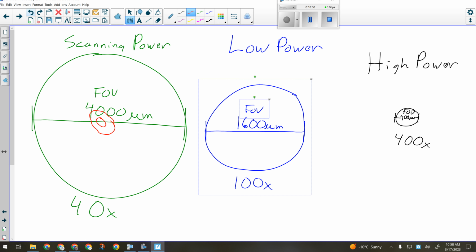On the new microscopes, which are not good, okay, see? This is what happens when you cut money from education. You get these ghetto microscopes. Okay, all right, so you'd have to actually use your fingers on the stage.